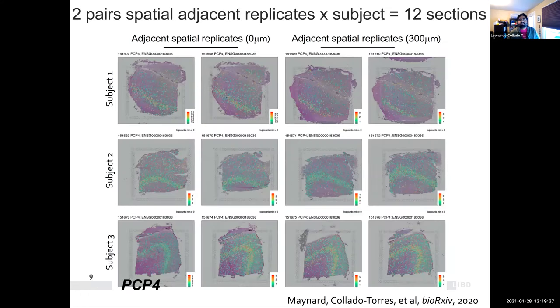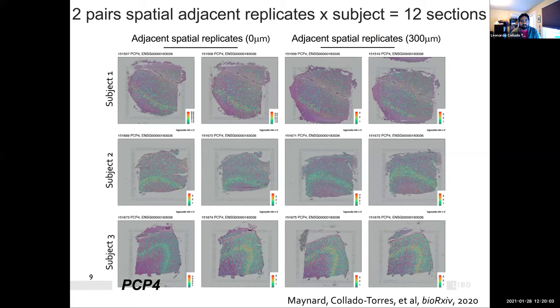Across all 12 replicates, looking at PCP4, we can see that the spatial replicates — columns one and two, then three and four — look really similar across the different subjects, which are on the rows. This probably provided some level of confidence in the Visium assay platform, suggesting it was generating reproducible results. We mostly see the same pattern across the different slices.